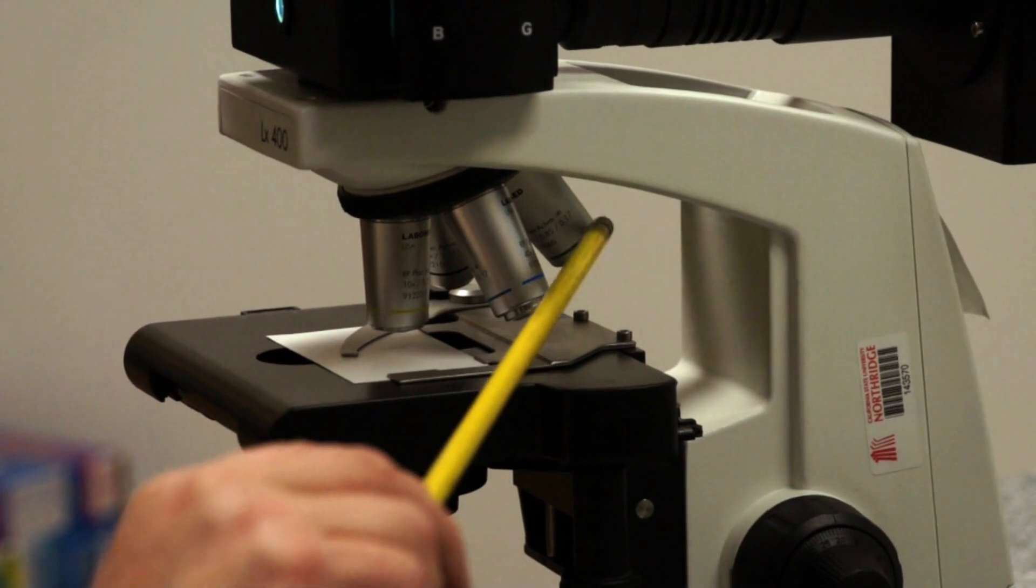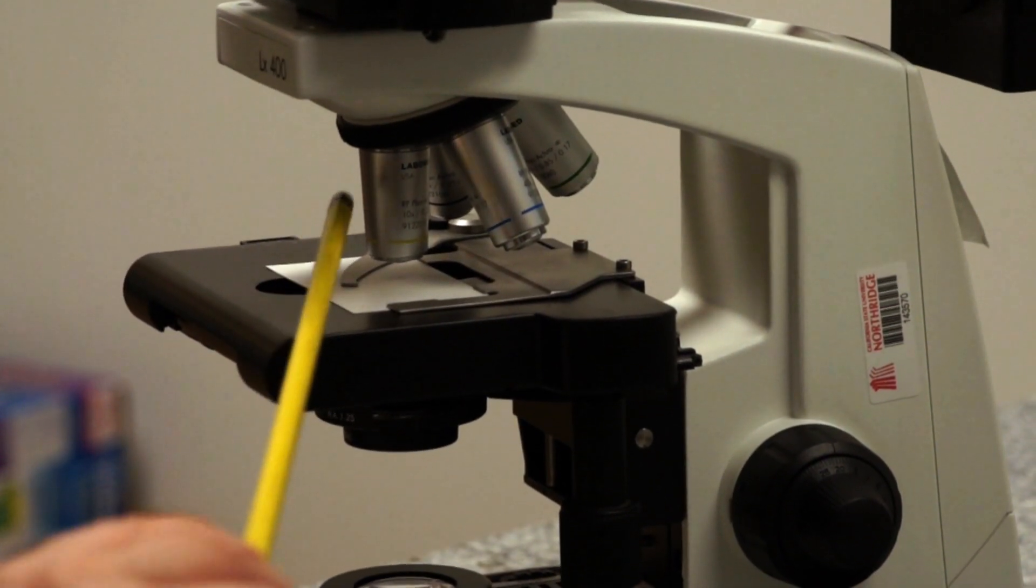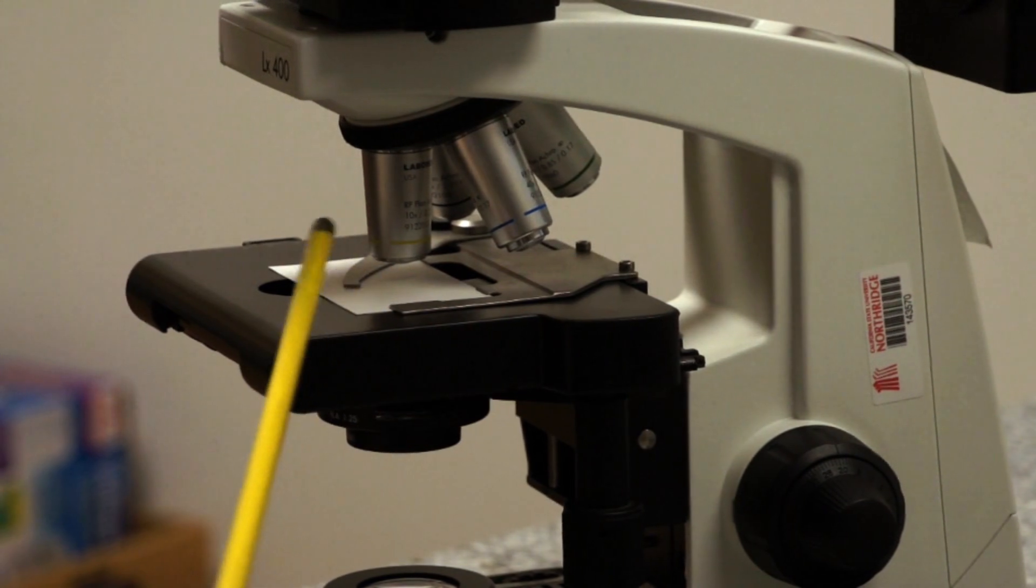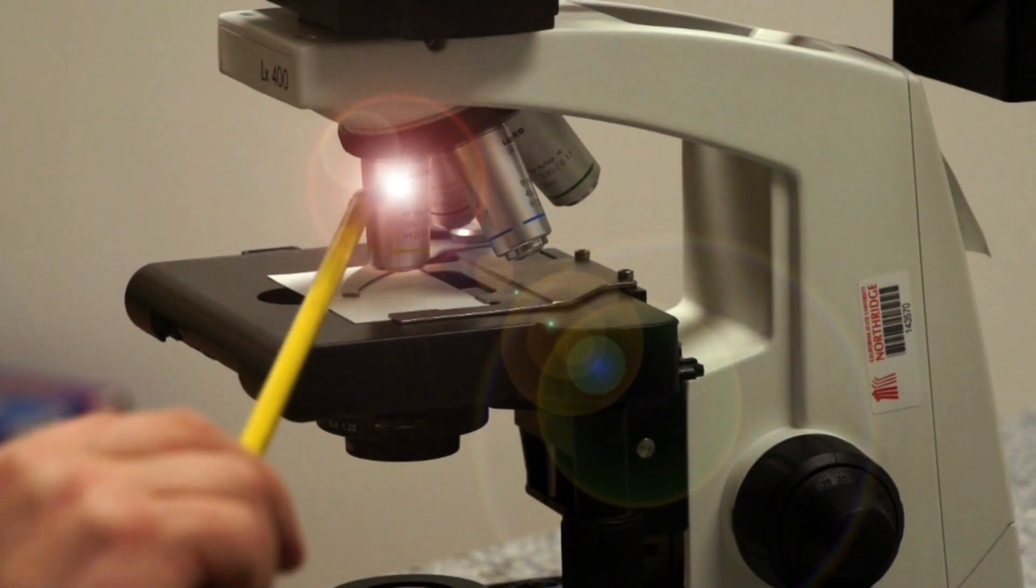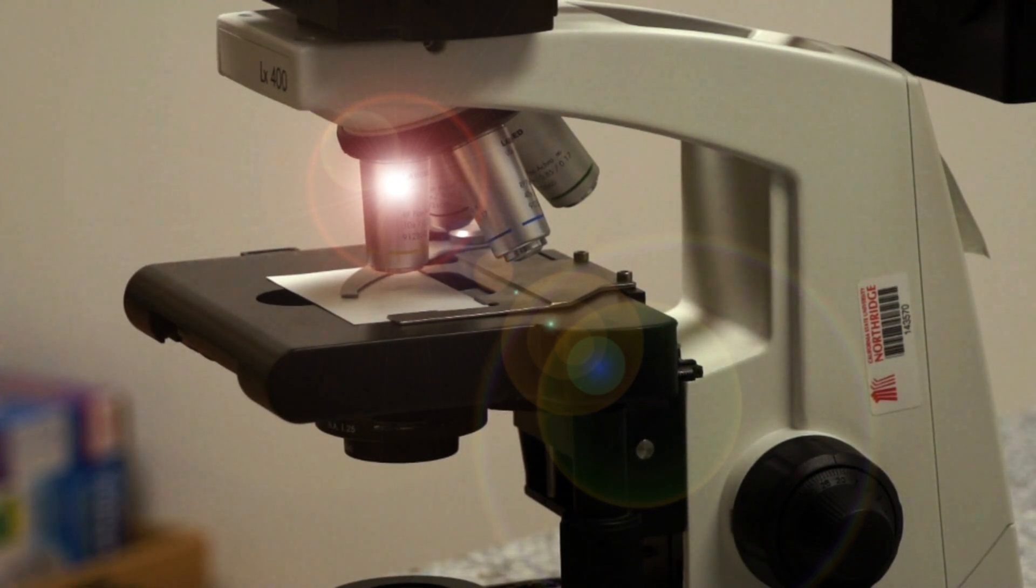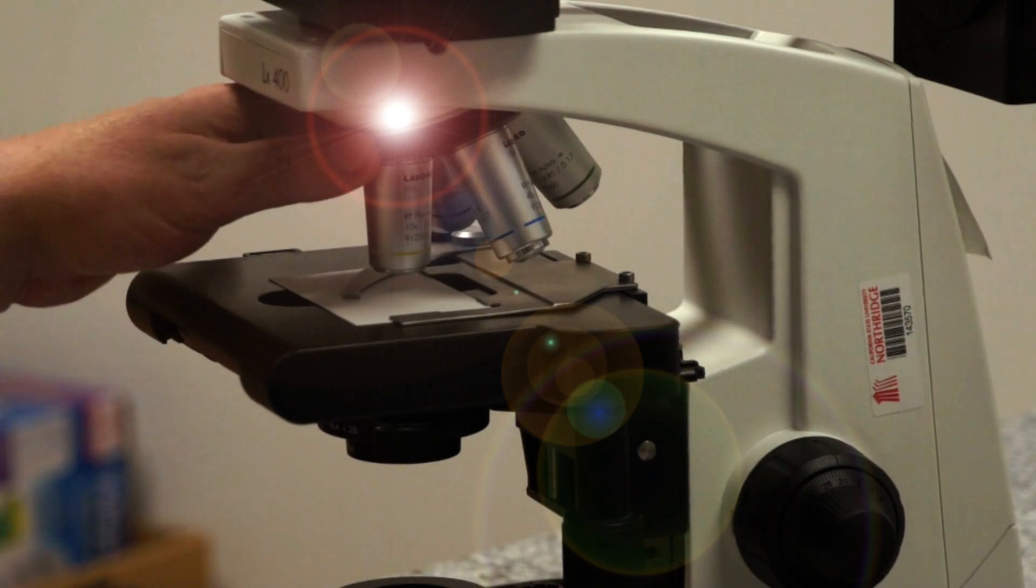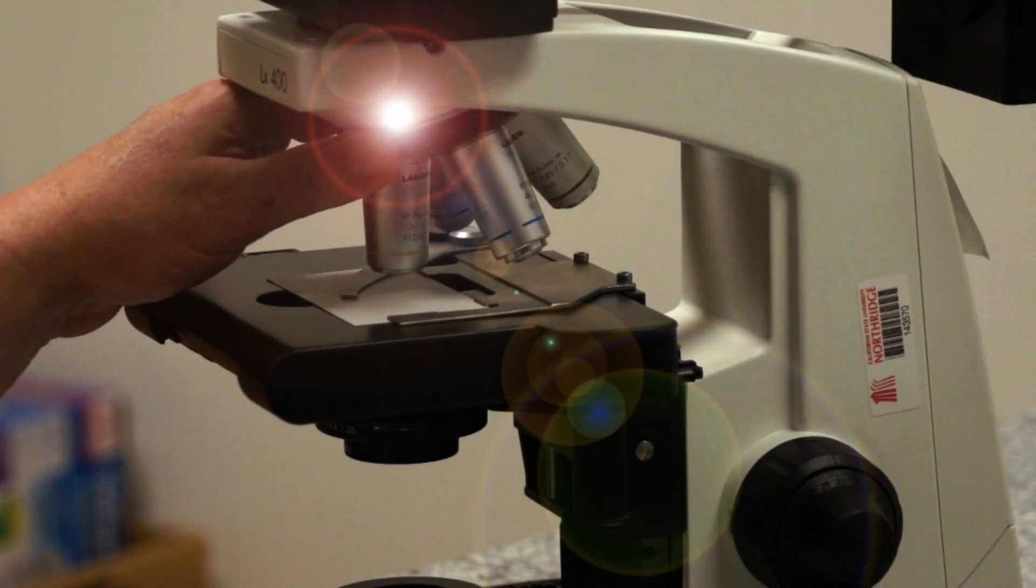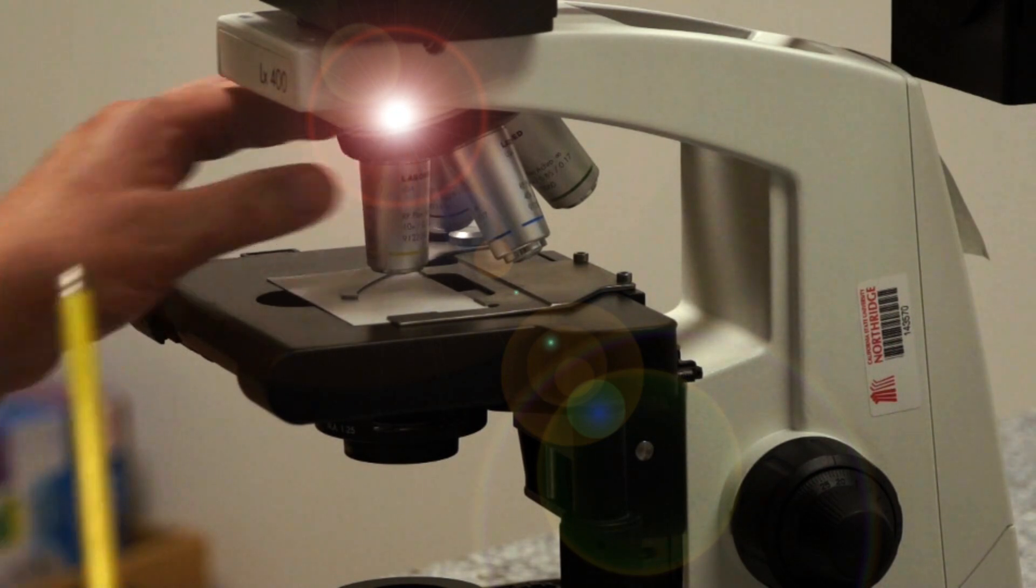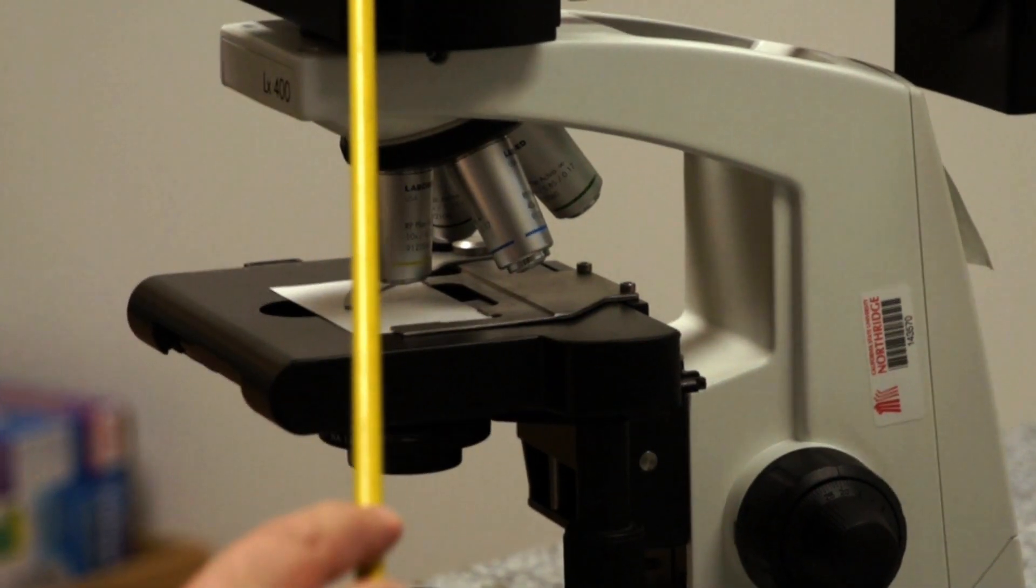Each of these is an objective. Each one is highly corrected for the magnification that it produces and the resolution. We'll be discussing that more later. Then the light travels through the objective where all the useful magnification takes place. It goes into the nose piece and you rotate the objectives by holding the nose piece on the knurled rubber band.